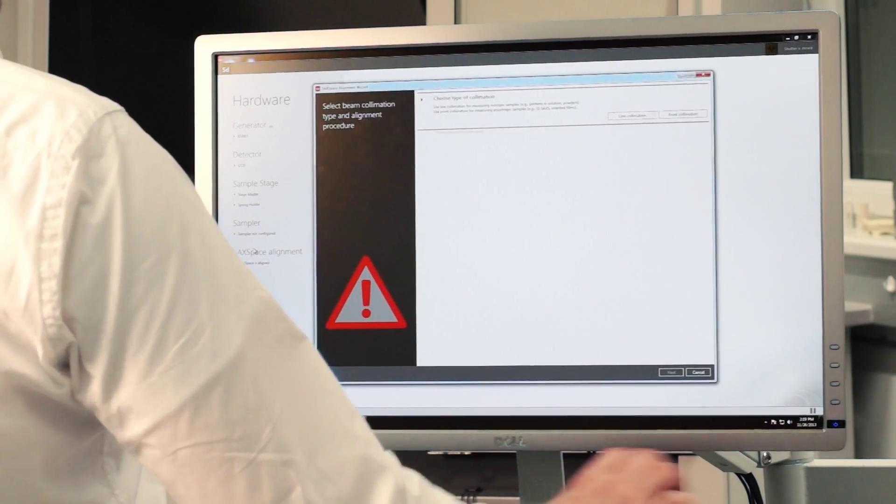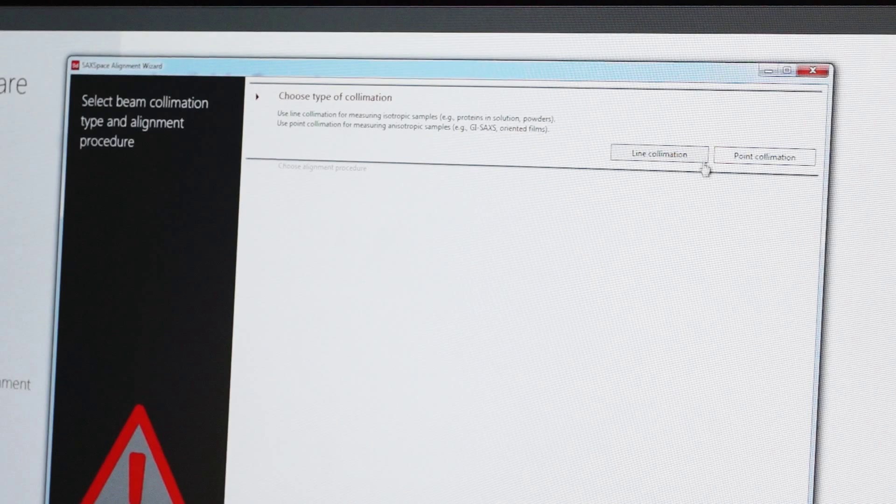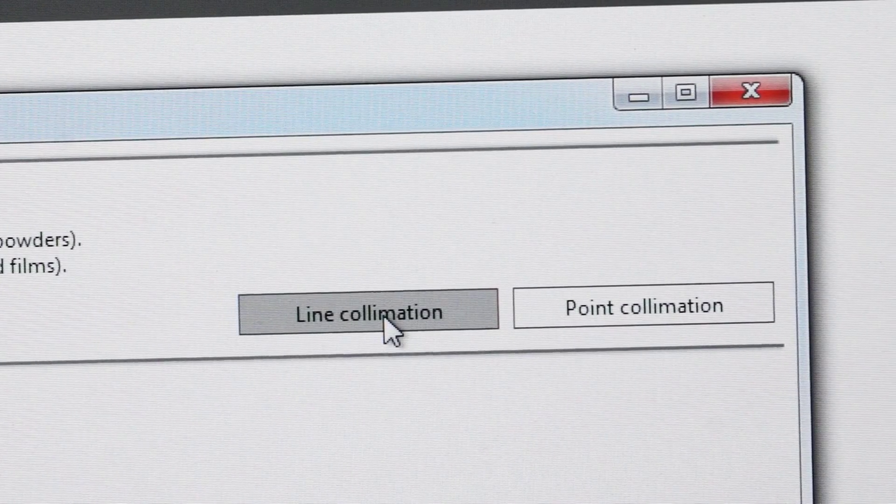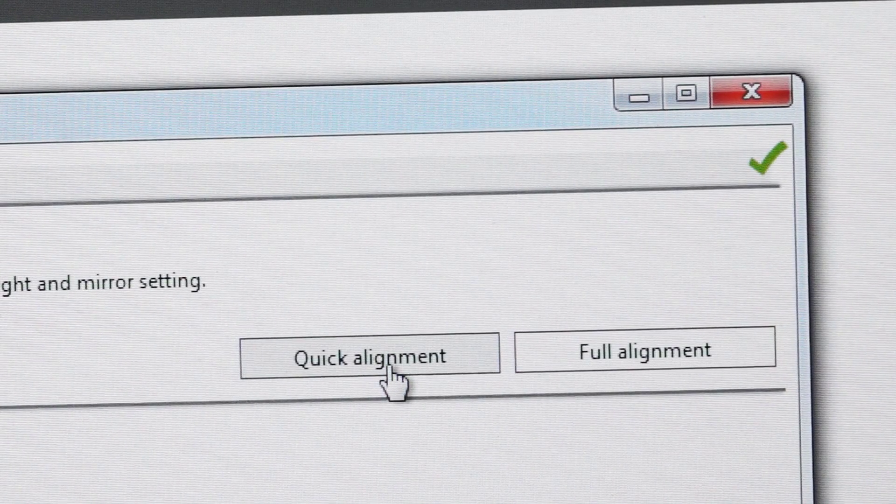In contrast to this, the new SACS base system offers automatic alignment, which is also easily carried out by SACS beginners. This is a feature called True Focus.